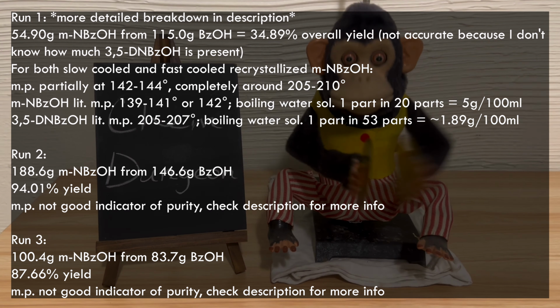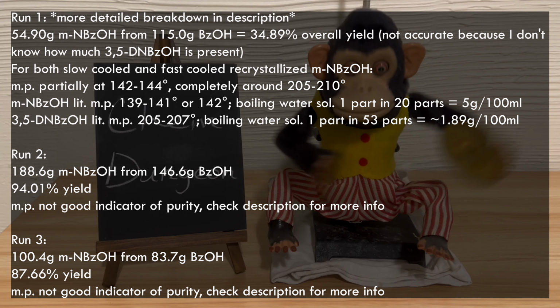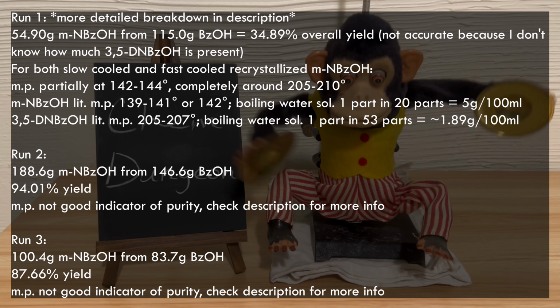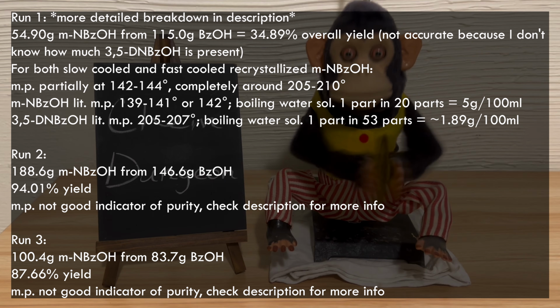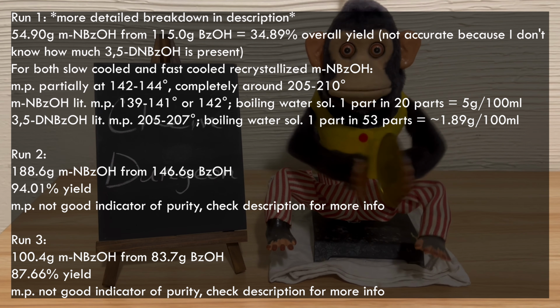Here's a breakdown of all the reactions and their yields. Obviously, the first run sucked for the reasons you saw, but after checking the melting points of both crops of crystals from the recrystallization, I found another one.